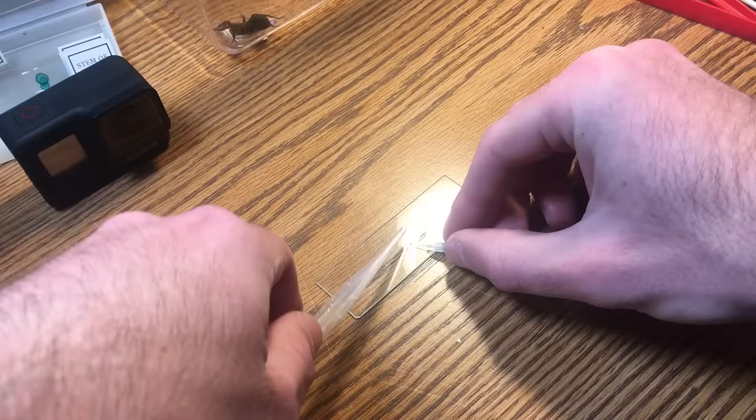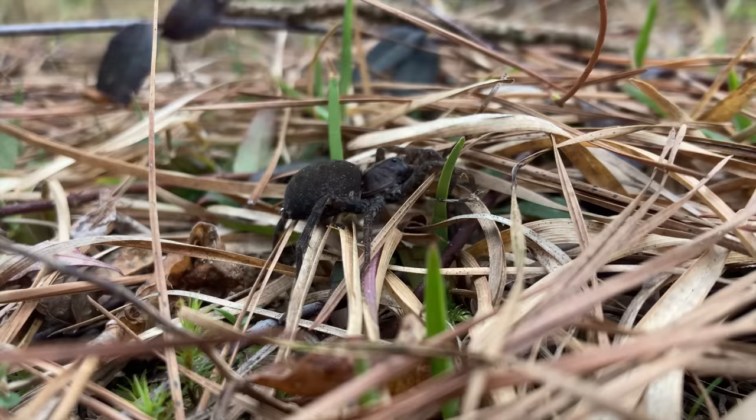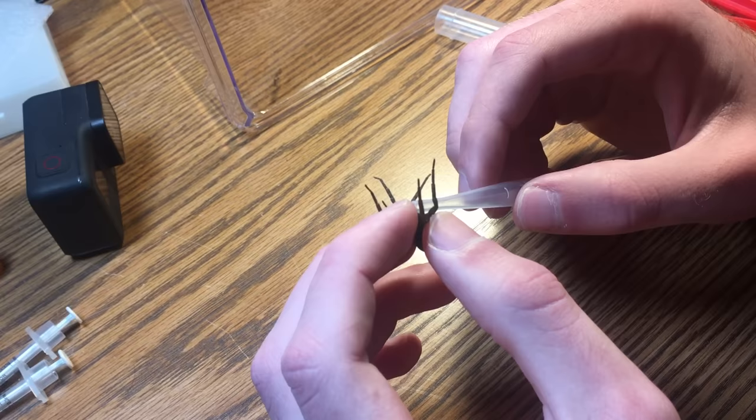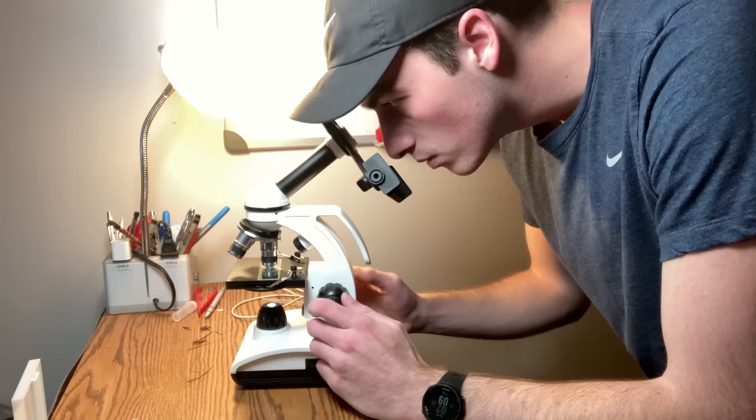Thank you so much. To be completely honest, I wasn't 100% sure that I even got enough venom to see a reaction. This may be big as wolf spiders go, but in the grand scheme of spiders, it's not that big. So the venom output is not going to be that much. But once I looked under the microscope, I was shocked at what I saw.